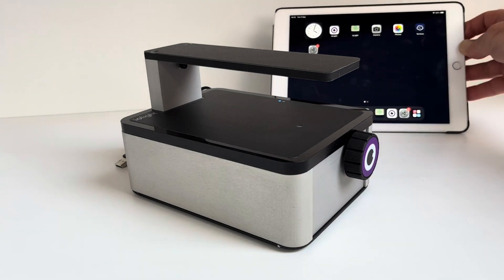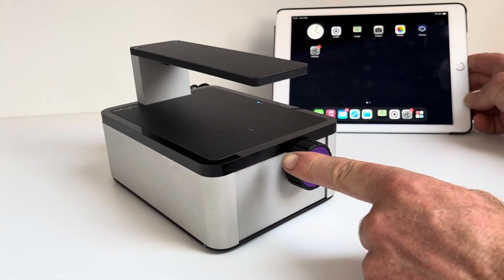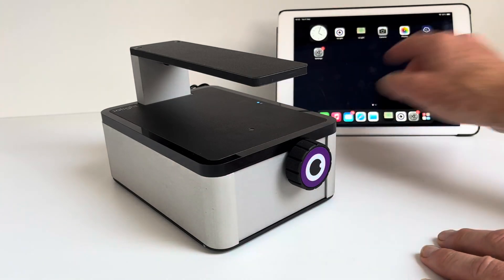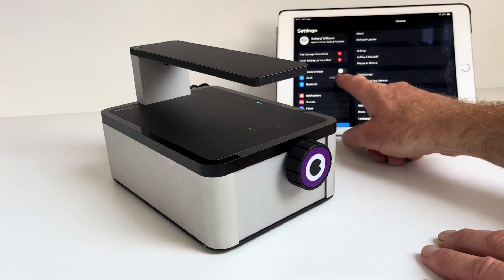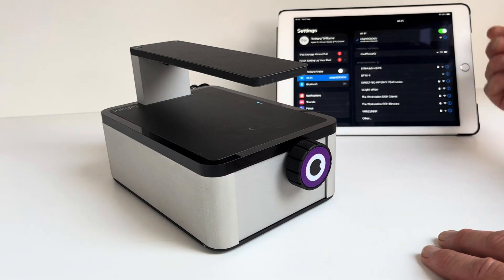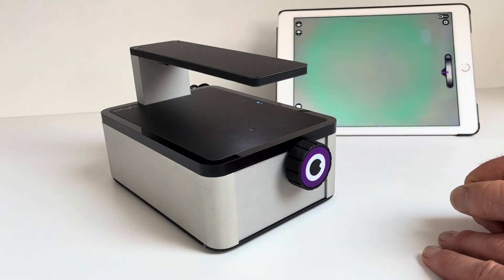The microscope works like all the other iolite microscopes do. The microscope produces its own little Wi-Fi network, so independent of the internet. You then go to your device — your iPad, your computer, or Android device — and you connect to the iolite Wi-Fi network. You can then open the free iolite app and that gets the microscope running.